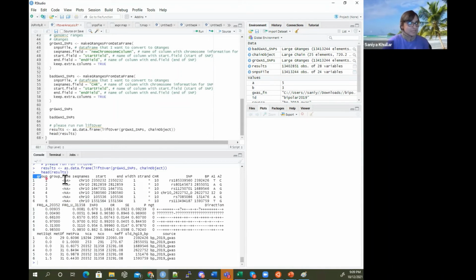Okay, great. So now we see seqnames is this, and because we kept the original, we still have this original column here. I know a lot is redundant, and because these are huge files, you might want to remove redundant things. But now what you're going to see is, okay, this is the same. And if you didn't save the old one, we have it here, which is 239, but you might be confused. All you need to know is that this is the old base pair for this first row. These end up being the same, but I remember BP is sometimes not as informative. So the old one is 2392426, which is what we were looking at here.